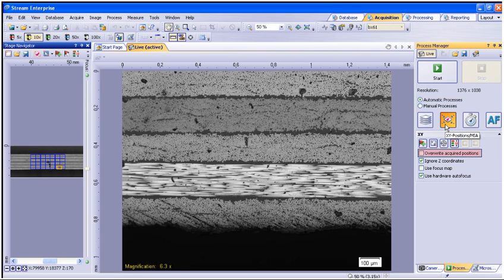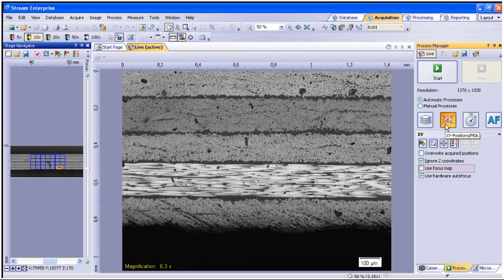You can also select to overwrite the acquired positions to clear old scans and capture all new. The software can ignore any Z changes or focus changes that may happen during the scan. You can choose to use the focus map or hardware autofocus if the system has this option.